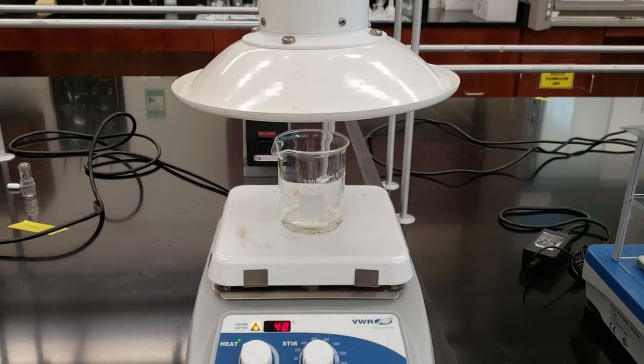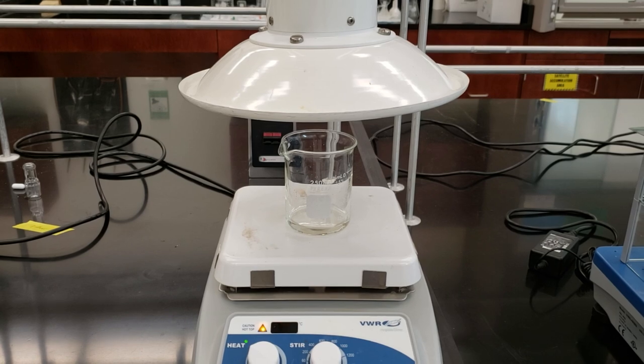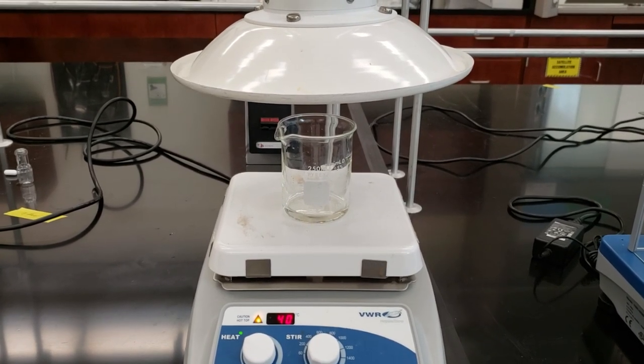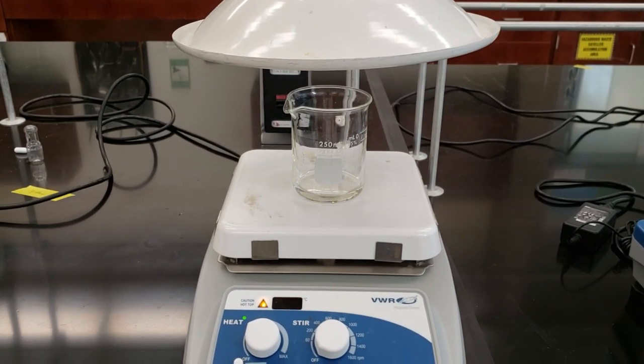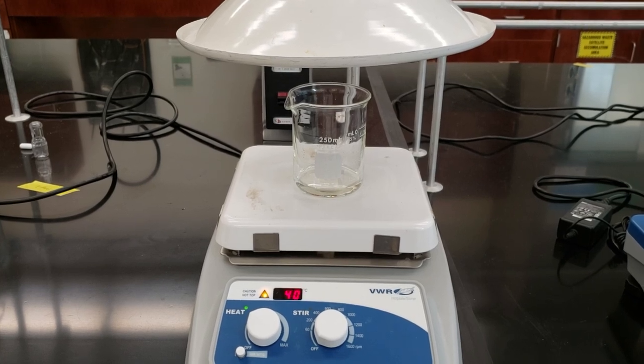We've taken our beaker containing our diethyl ether and methylene chloride mixture and our product, and we placed it on a hot plate. We've set that to 40 degrees Celsius, placed it under our snorkel, and we're going to let our solvents evaporate off into the snorkel system so we can obtain our final product.